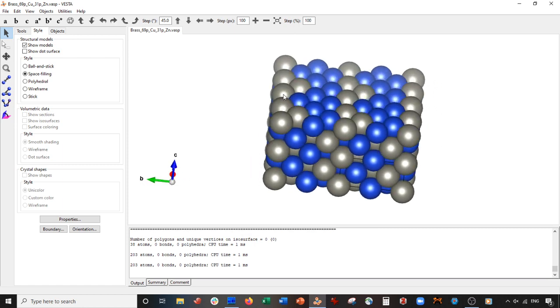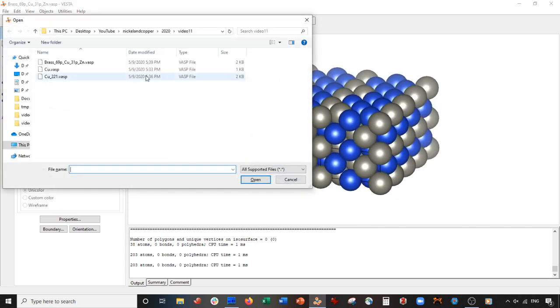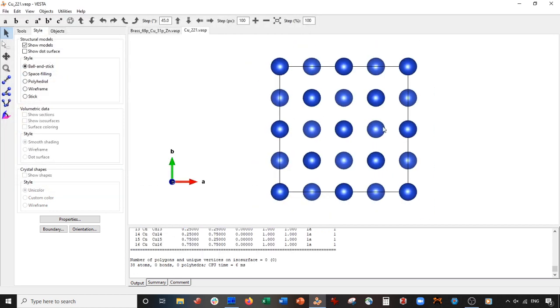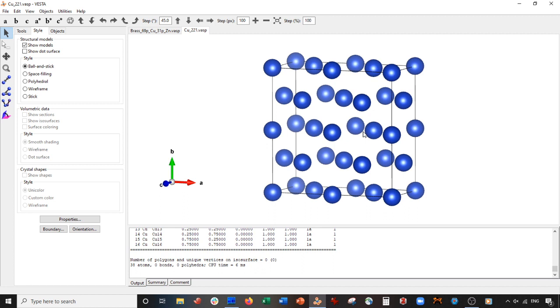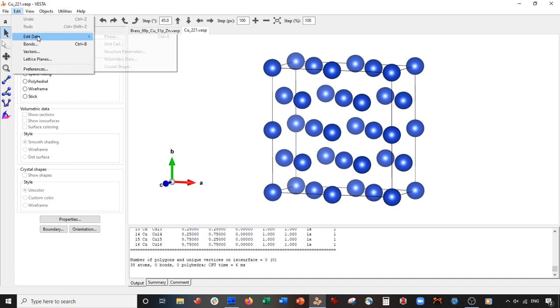Now the question is, how do we do the bronze? So for the bronze, what we're going to do is we're going to reopen our expanded copper unit cell, this 221 file. And now what we have to do is do 88-89% copper, 12-13% tin. To do this, we can replace just two of the copper atoms with tin. So can you pause the video and do it? Try it. If you unpaused it or just kept watching, go to Edit Data, Structure Parameters.